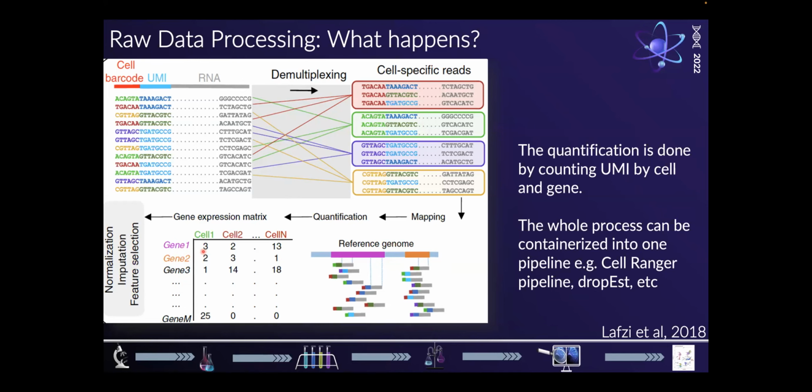So you're going to have an expression matrix with this particular number of genes, more like a 2x2 table, for those who know what a 2x2 table is, whereby each square represents the total number of reads for that gene in that particular cell, all the way across the total number of cells that you have in there.